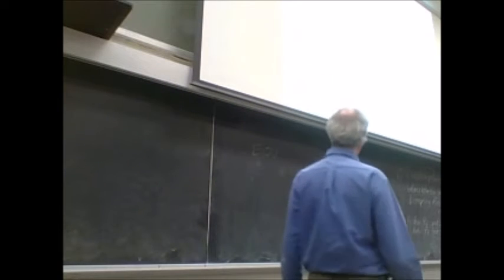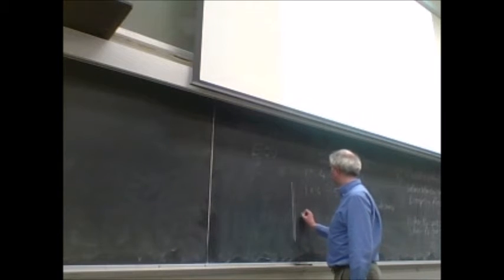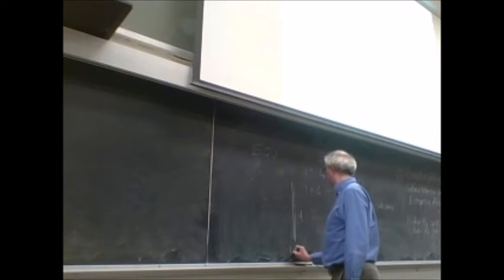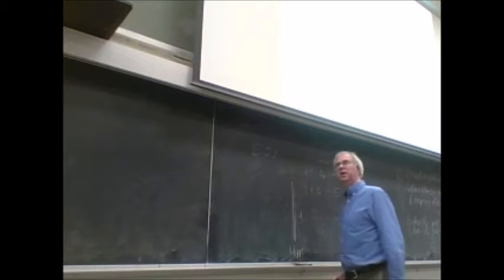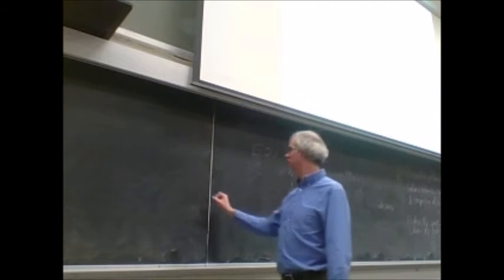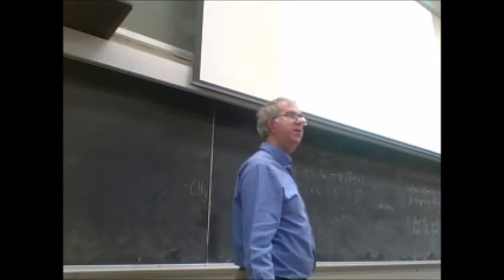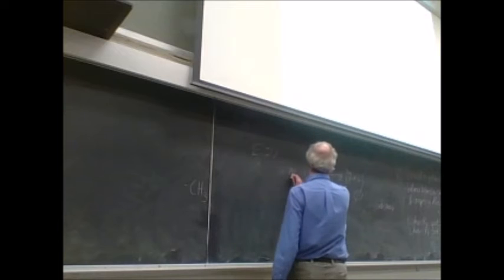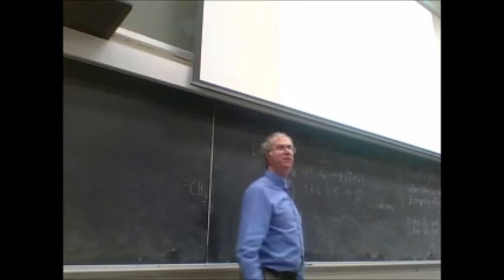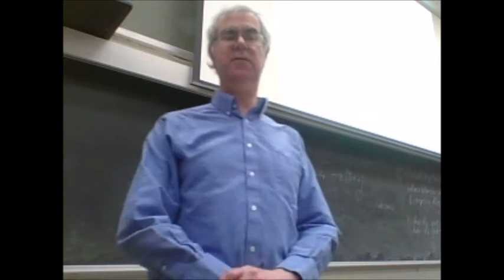So we have a doublet at 1.6 ppm. And that's 3 H's. That gives us then a CH3. We know that because it's 3 H's. The integration is the most important thing for helping you figure out what your unknown is in most of these cases.